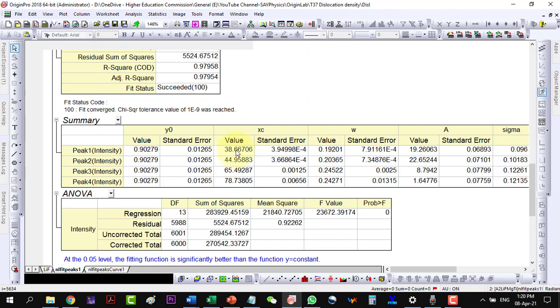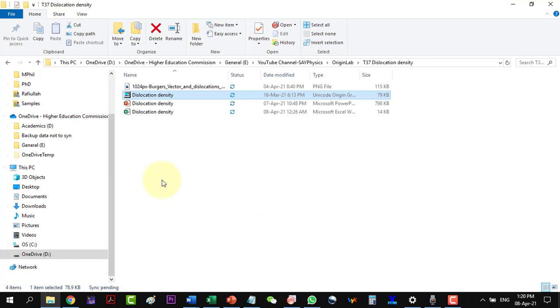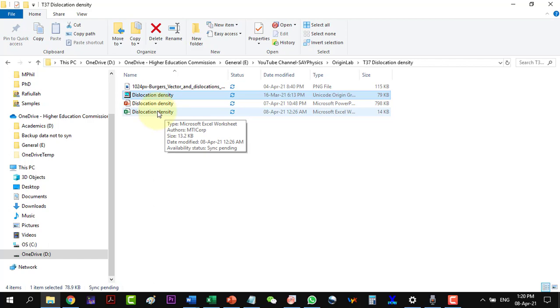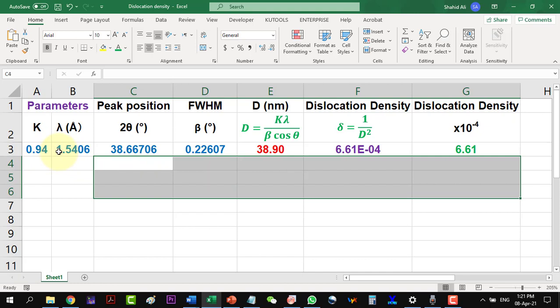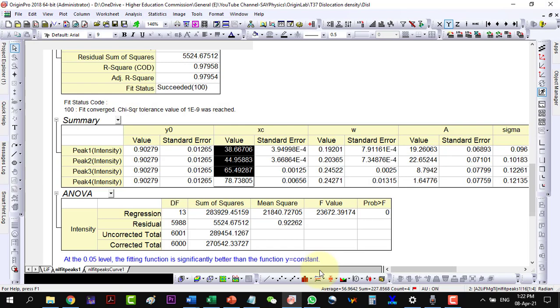Go to the Excel template, where the dislocation density can be calculated. This is the K value, the X-ray wavelength, and here are the two theta values. Paste the copied values here. Now I will have to copy the beta values from Origin.